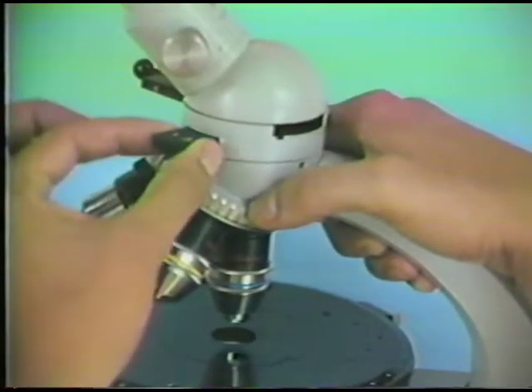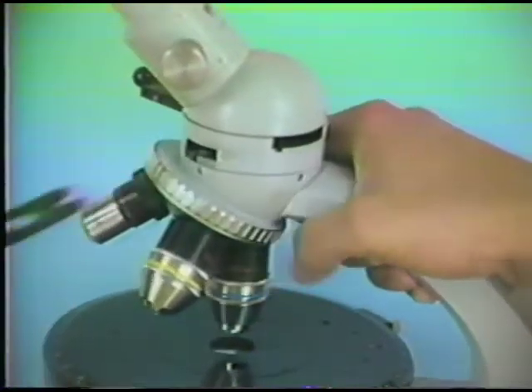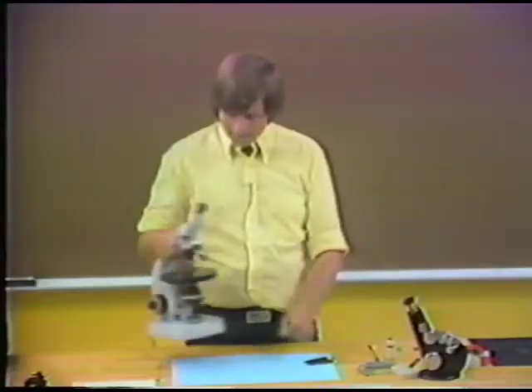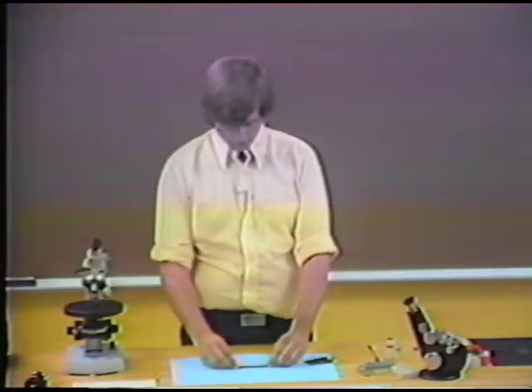So we take these accessory plates and slide them into the accessory slot like this, and we'll be doing optical tests making that manipulation.